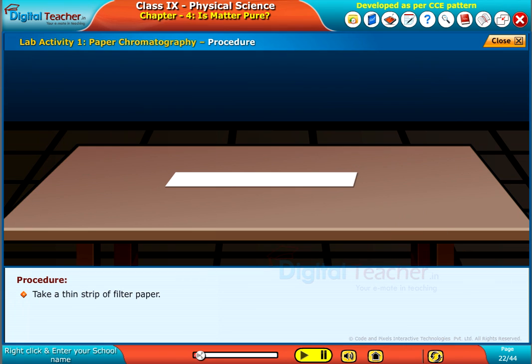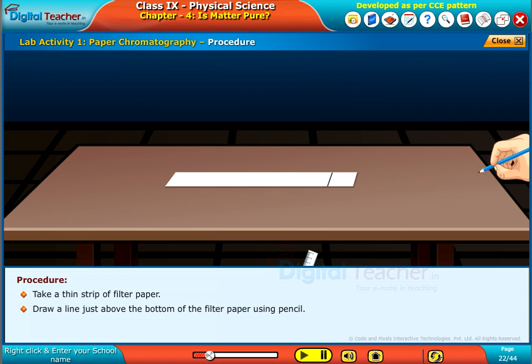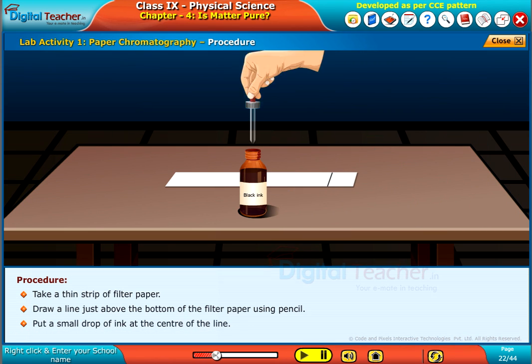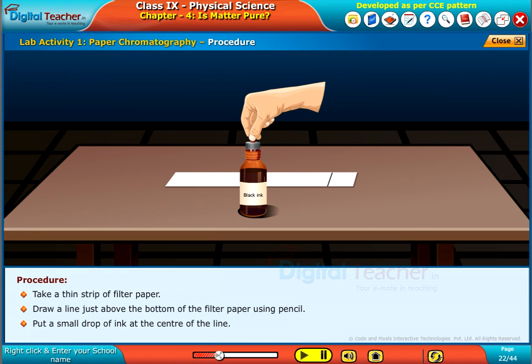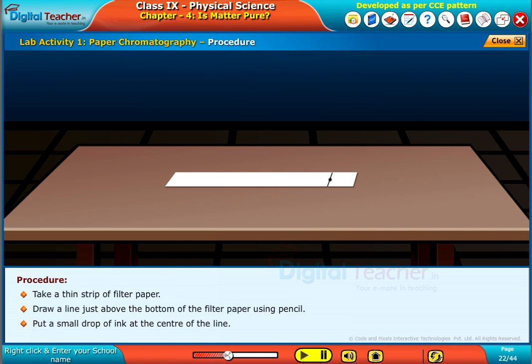Take a thin strip of filter paper. Draw a line just above the bottom of the filter paper using pencil. Put a small drop of ink at the center of the line. Let it dry.